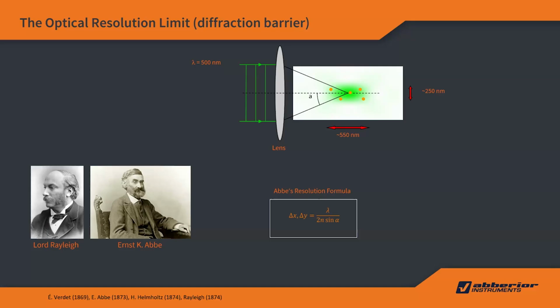So this is a large light dot, which is scanning your sample in a confocal microscopy. And then, for example, in this illumination volume, there are 5 molecules being excited, and every one of these 5 molecules emits light. And every light from these 5 molecules, when passed through the optical system onto the detector, is elongated again into a large American football-sized point spread function, this dot.